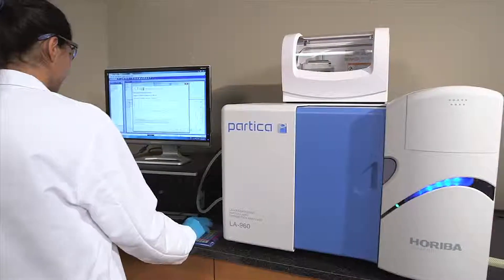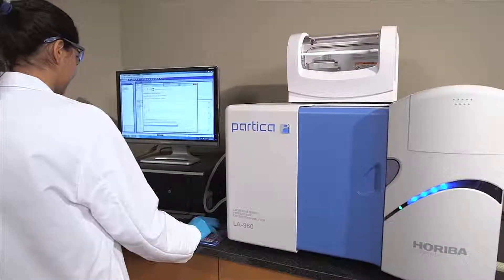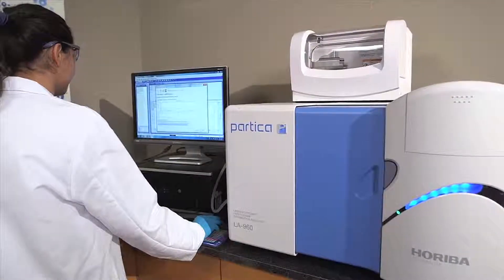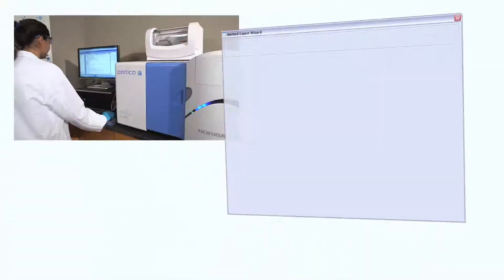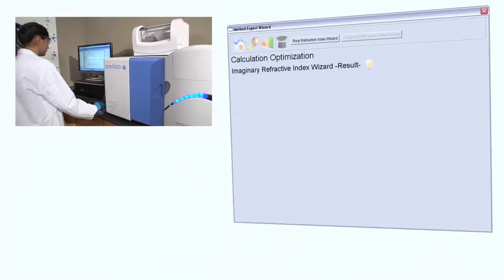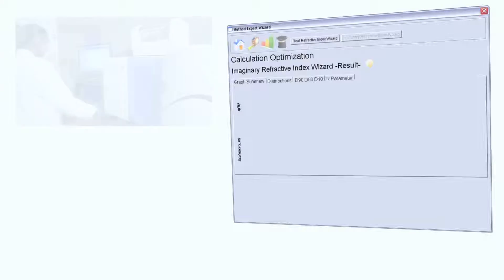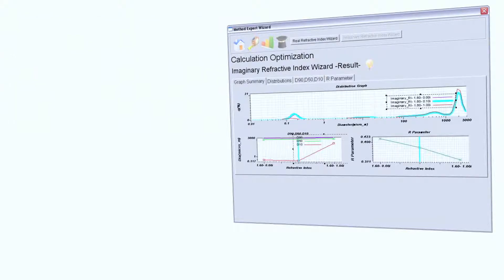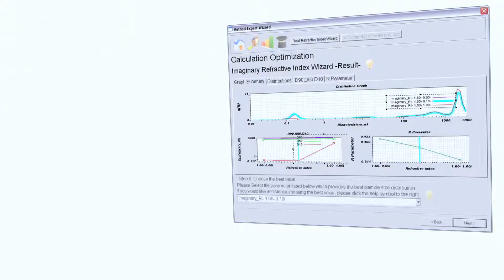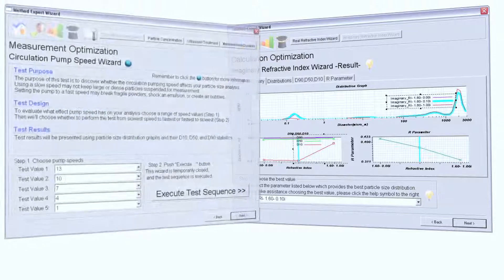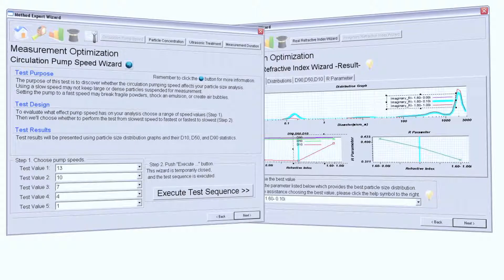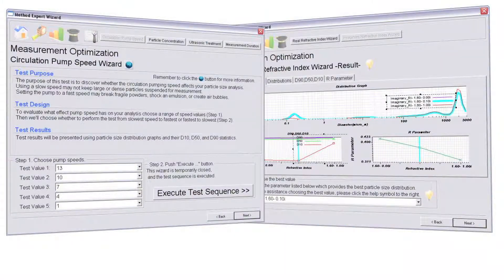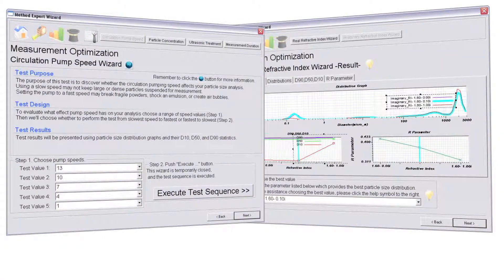The LA960 features the innovative Method Expert software. The Method Expert is an automated guided method development tool simplifying the complex science of particle size analysis with an easy-to-understand interface. The Method Expert recommends measurement and calculation conditions producing automation files for true one-button operation.